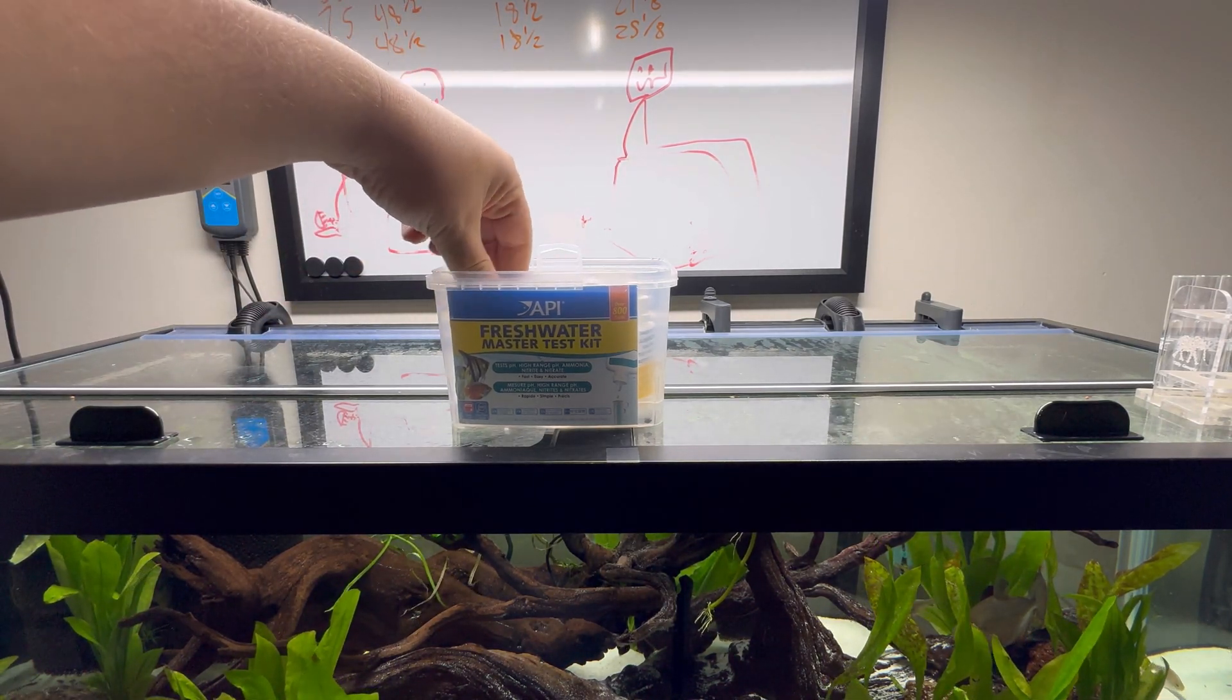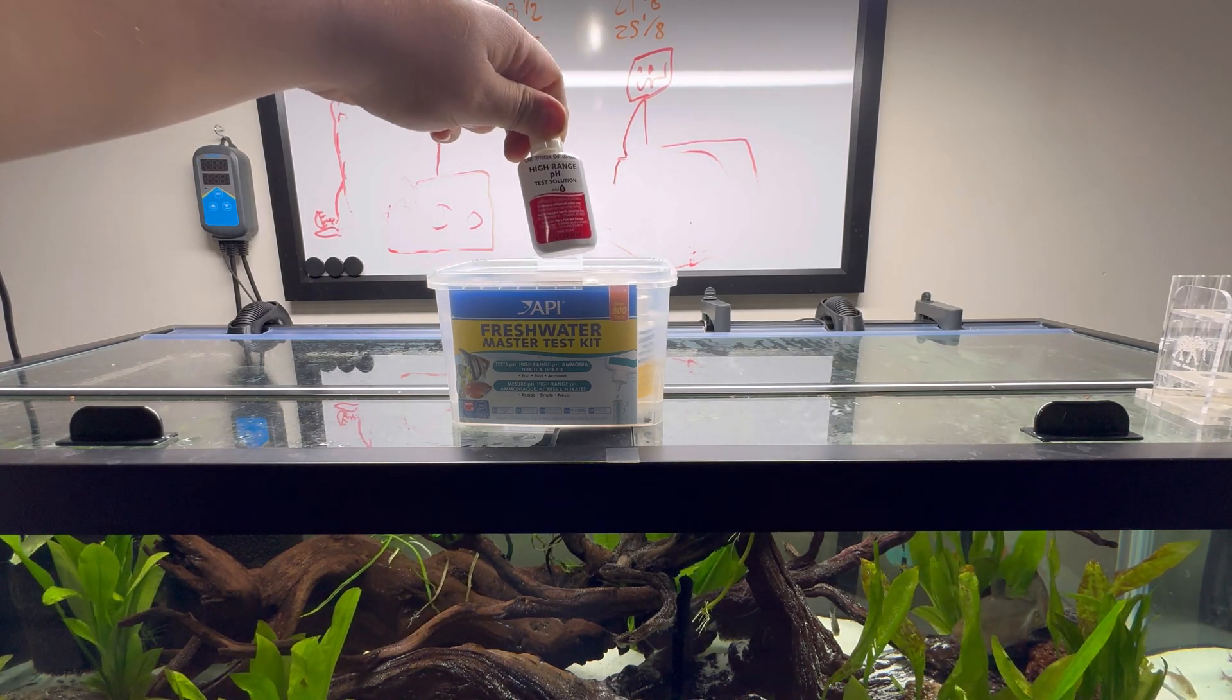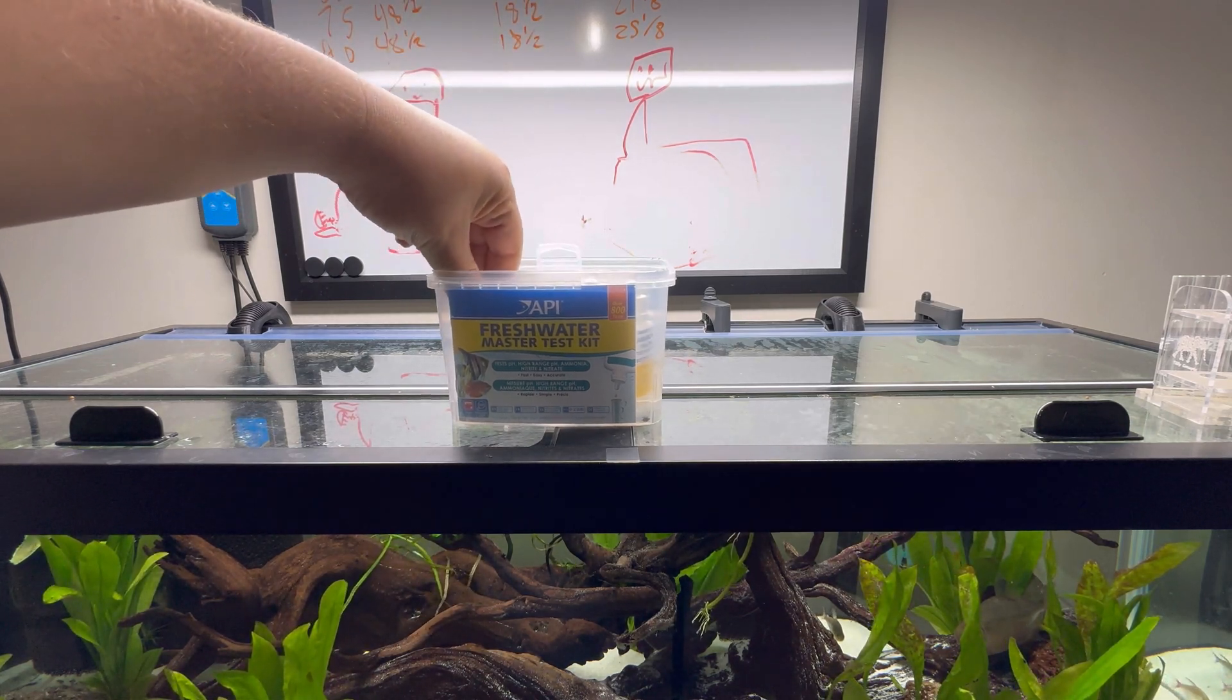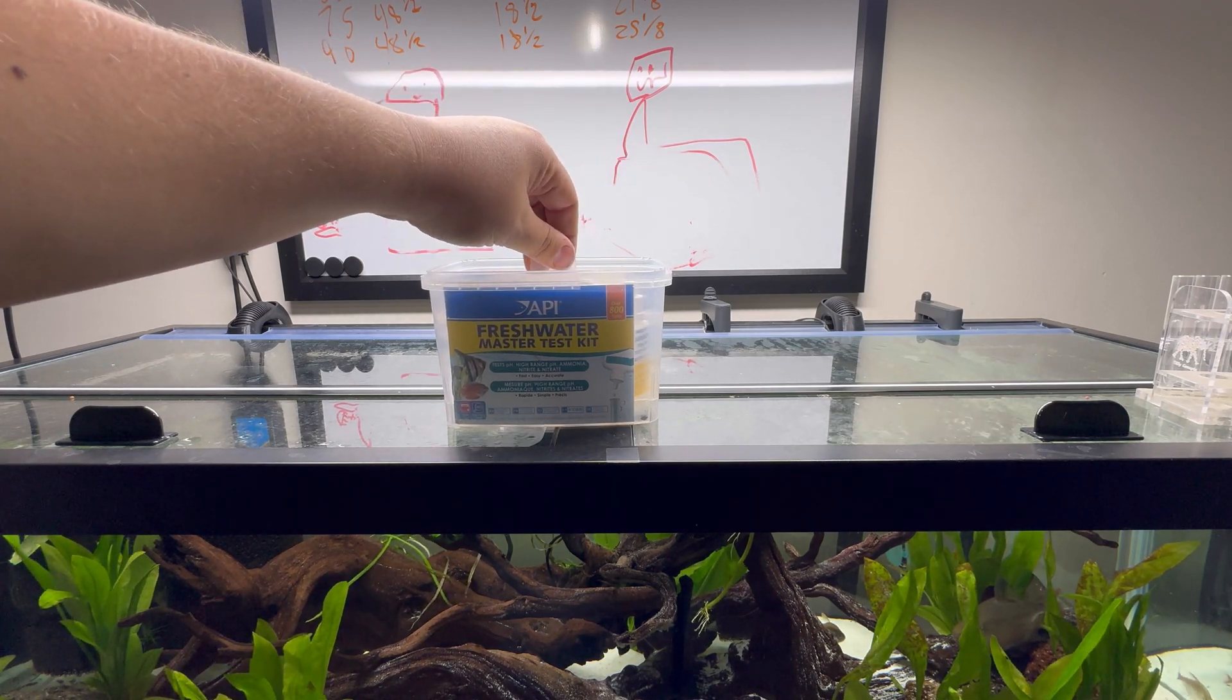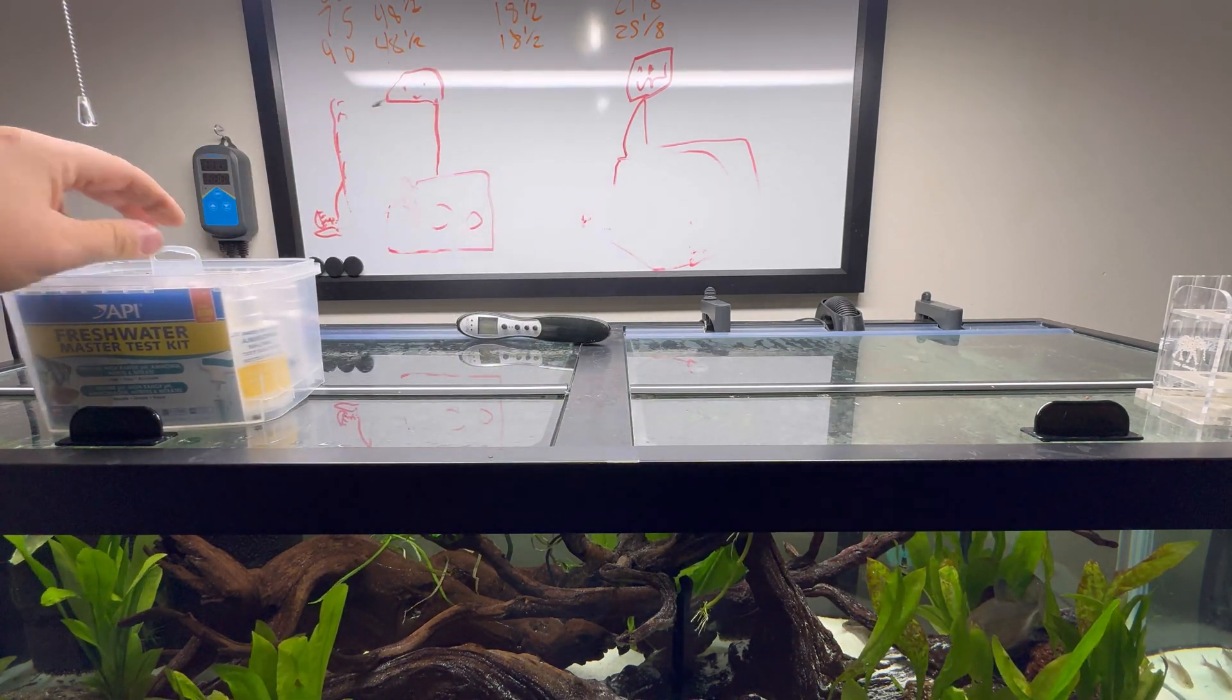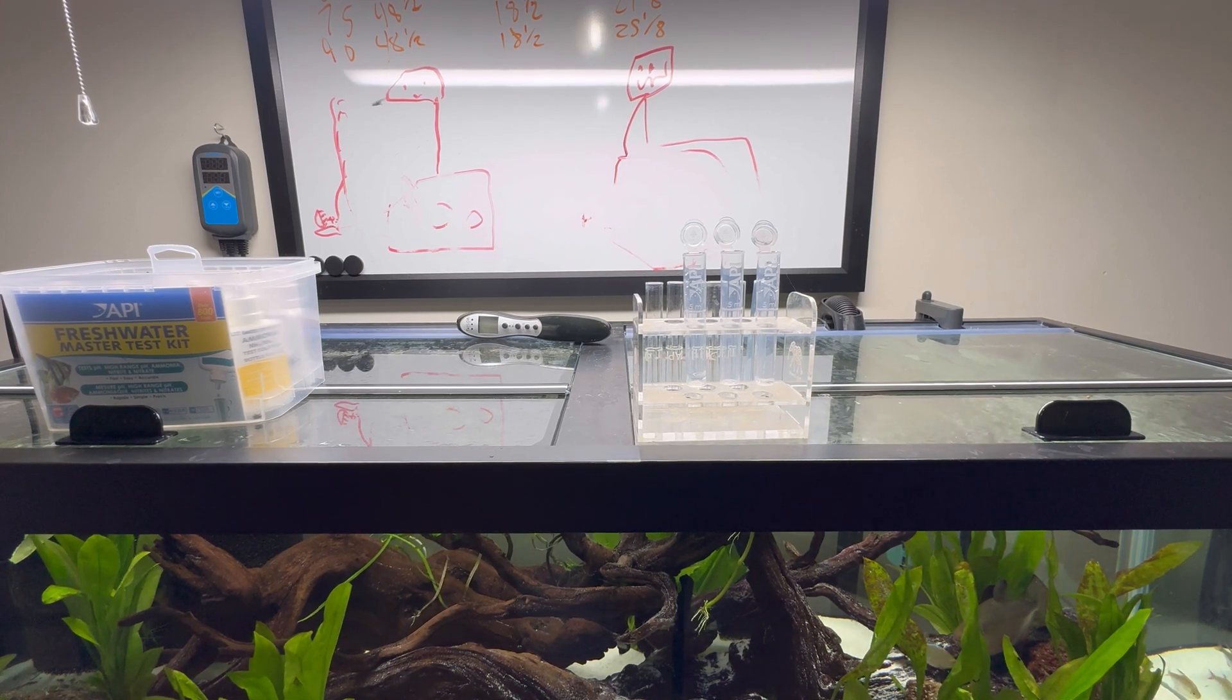First things first, we're not going to use the pH test just for the sake of the video. It's super simple: add five milliliters to the tube, put in either five drops for the high range pH or three drops for your regular pH chemical, shake it up, read the result. We're going to skip that and jump right into the other three tests.